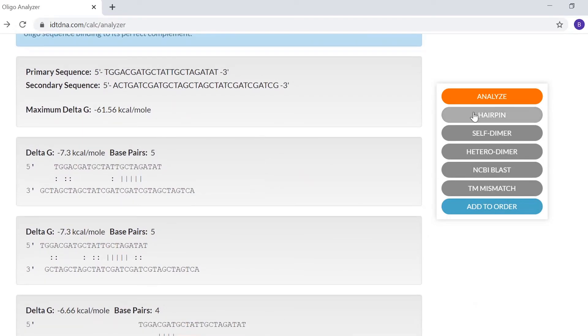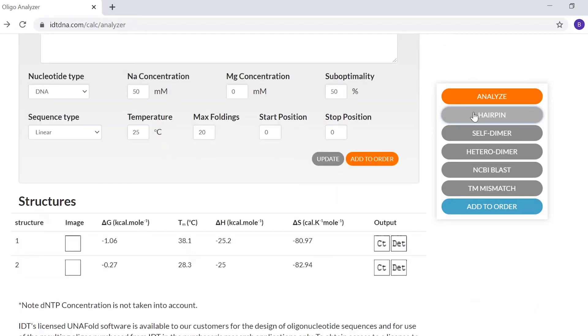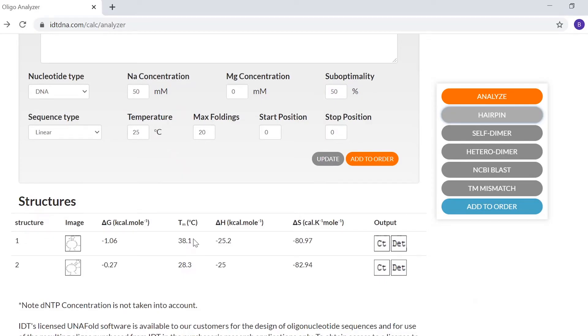Select the hairpin button to check the potential for the Oligo sequence to fold into a secondary structure. To avoid this, the hairpin melting temperatures should be lower than your specific reaction temperature. A higher number of stable hairpin structures at your reaction temperature also indicate a reduction in the Oligo's efficiency in speed and binding to its target.